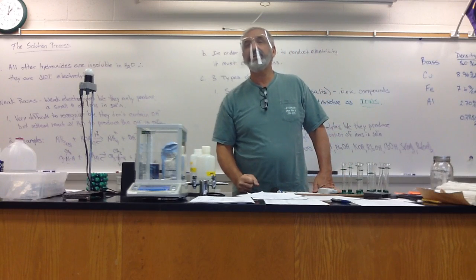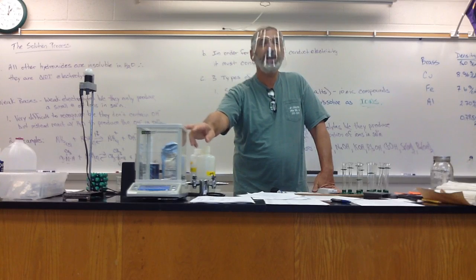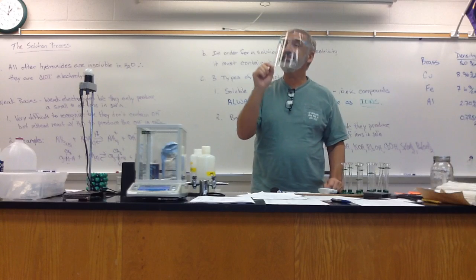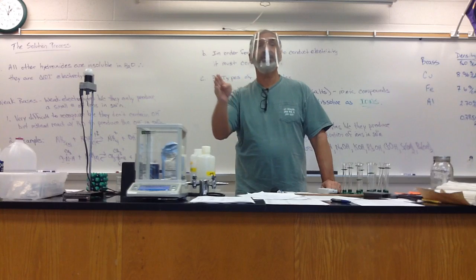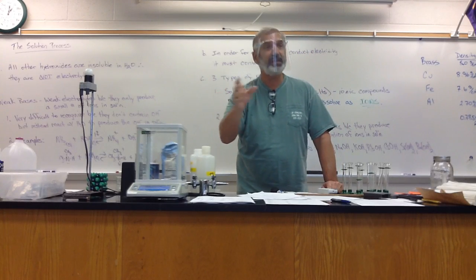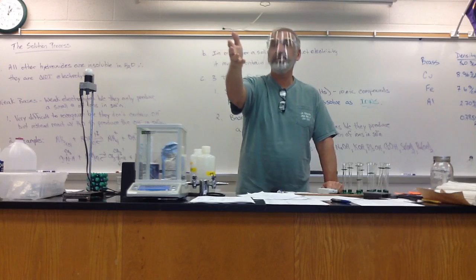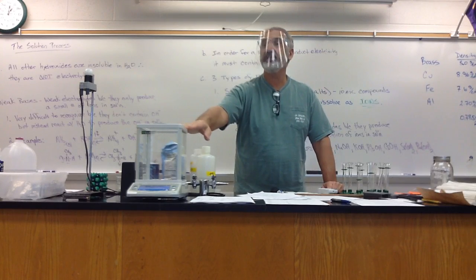All right, so we're going to get the mass with that. That's mass 1, and then you're going to get the mass here on this balance, and that's going to be considered mass 2. Now, when you have a digital display, you just assume that the last digit is uncertain. Remember, sig figs: when we do measurements, it's everything that we know for sure plus 1 digit of uncertainty. The balance has that figured in. They electronically round off. They actually carry it out more places, and they round to, what does it have, 2 decimal places on yours? This one's going to have 3 decimal places.